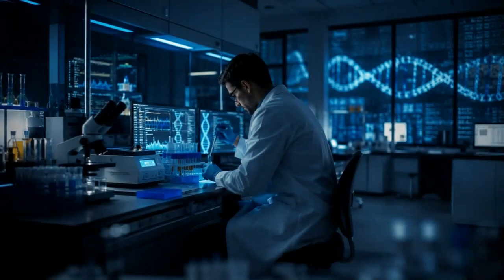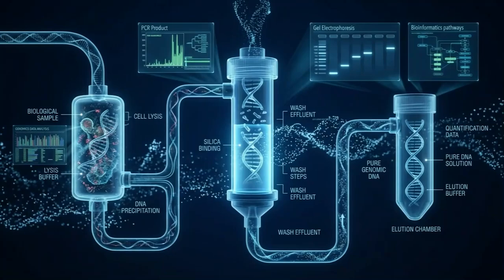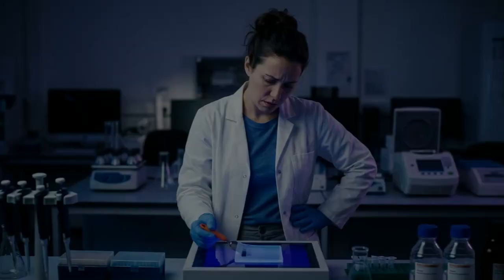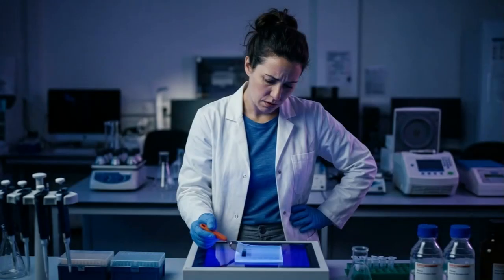Imagine spending days preparing a PCR experiment. Everything is perfect. High-quality DNA, fresh reagents, careful setup, precise protocol, and then nothing. No amplification, no visible band on the gel. So what went wrong? In many cases, the problem is not your PCR machine.